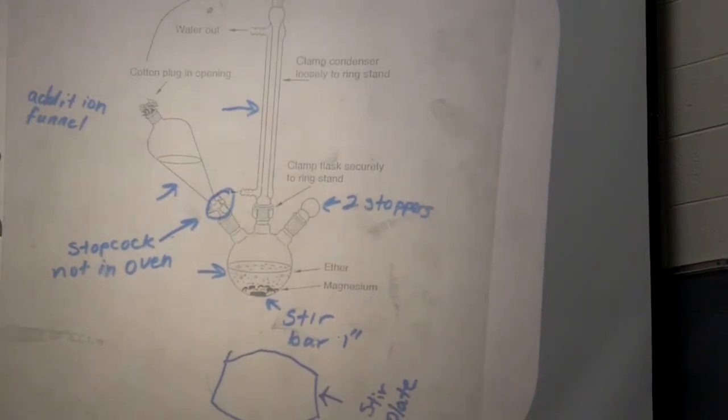Now, with that, what do you need to remember with ether? What do you need to be really careful of? It has a high vapor pressure. Also, what do you need to be aware of? It's really flammable, right? Okay.